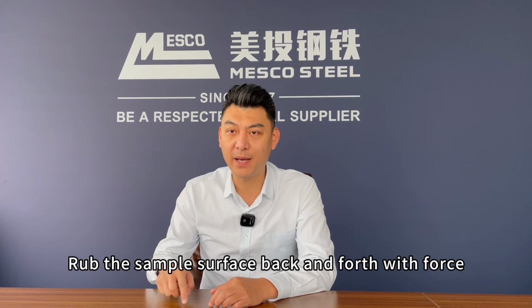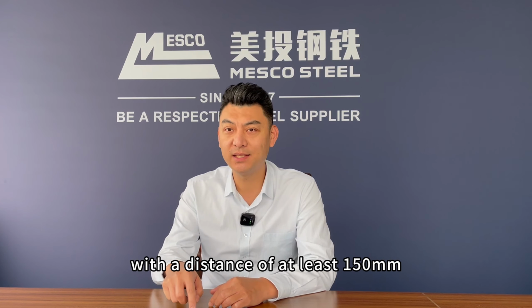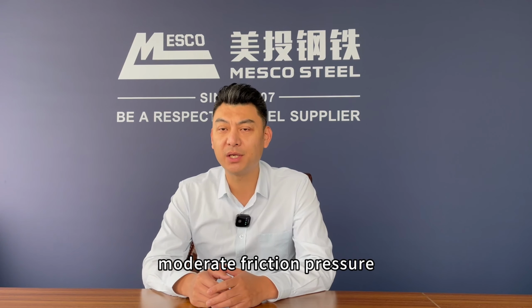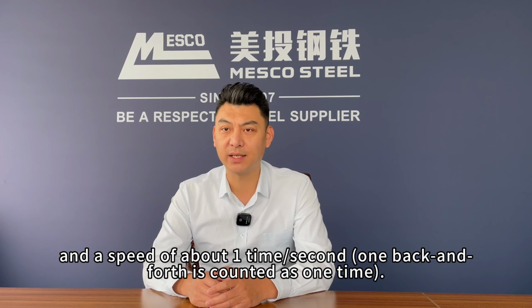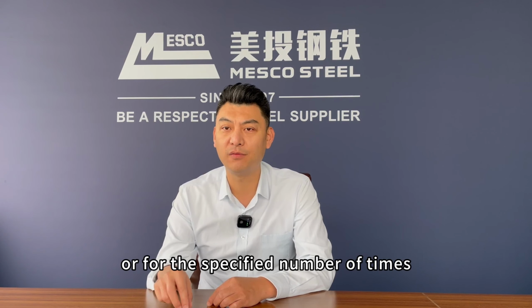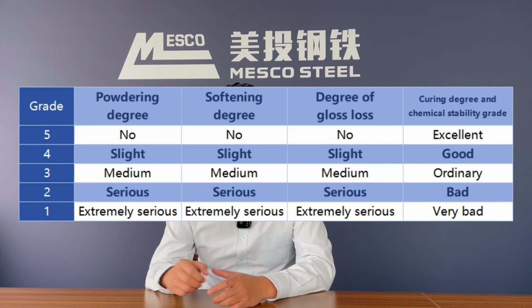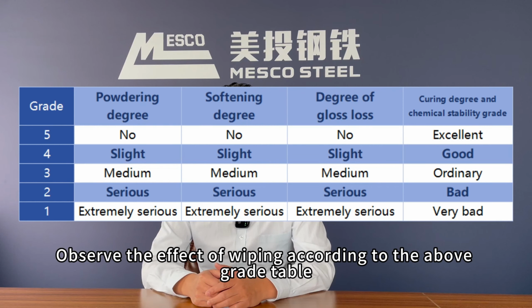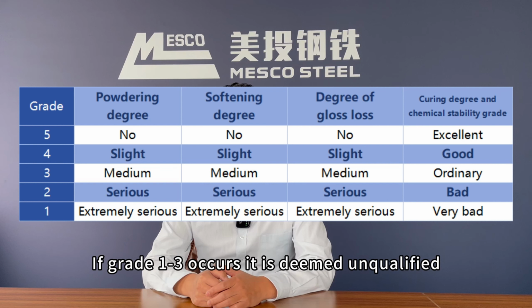Rub the sample surface back and forth with force with a distance of at least 150 millimeters, moderate friction pressure, and a speed of about 1 time per second. Keep the gauze moist throughout the entire process and rub it until the paint film is damaged or for the specified number of times. Wipe the metal surface back and forth 50 times without any peeling. Observe the effect of wiping according to the above grade table. If grade 1 to 3 occurs, it is deemed unqualified.